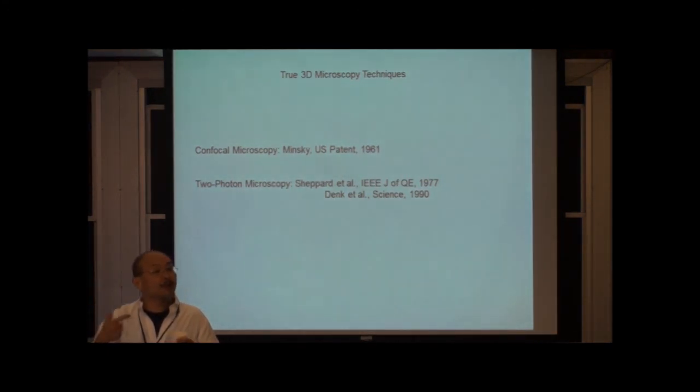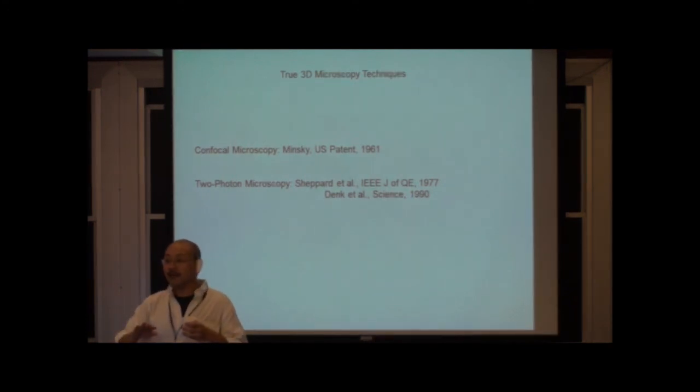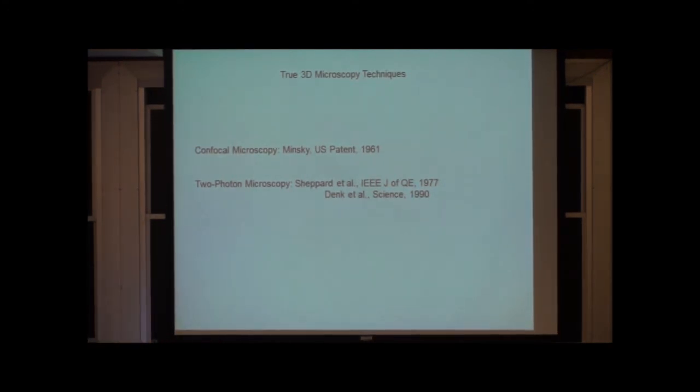So you have no depth resolution in your microscope. So the trick is, can one develop a method that is 3D resolved so that you can extract information on a plane-by-plane basis? There are two quite traditional methods today.